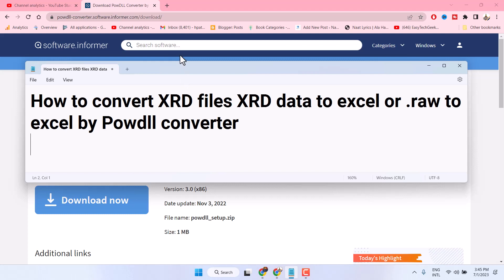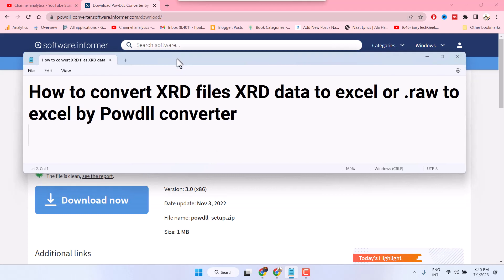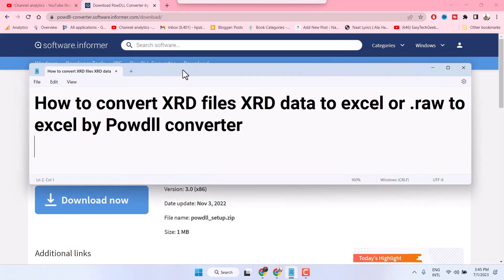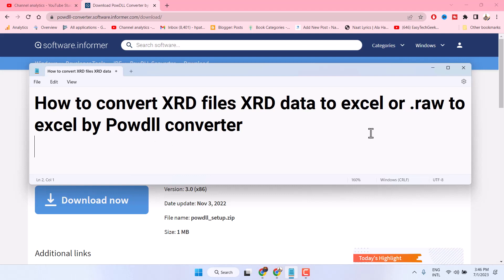Hello friends, in this video I will show you how to convert XRD files — XRD data to Excel, or .Raw to Excel — using this software, PowDLL converter.